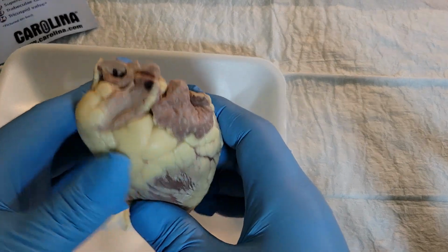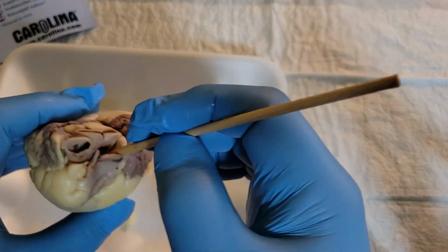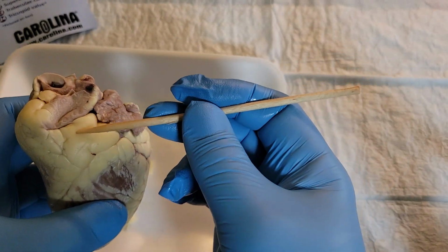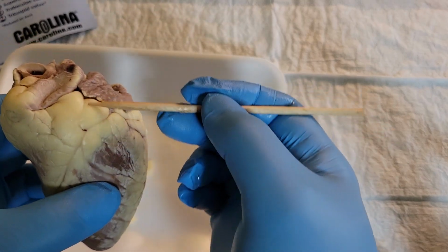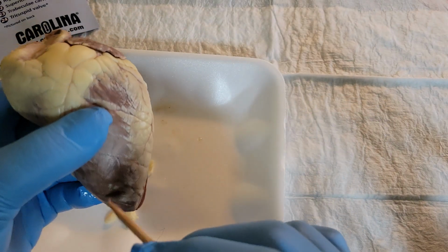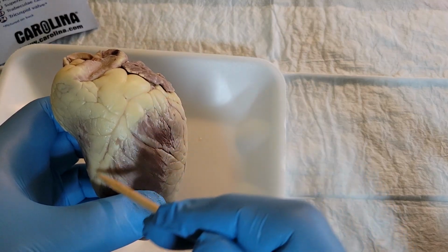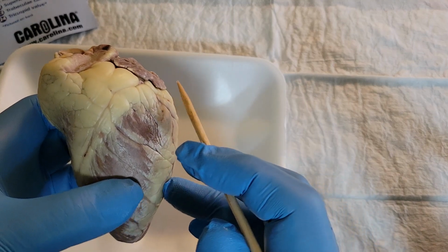So first off, this is the anterior side of the sheep heart, and right here is the pulmonary trunk. Next is to show you adipose tissue, which is pretty much all the light colored tissue that surrounds the heart. The apex is the corner tip of the heart. The anterior interventricular sulcus is this division here that divides the left and right ventricles.